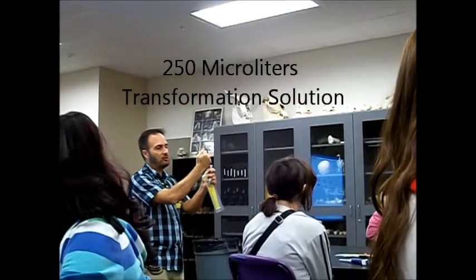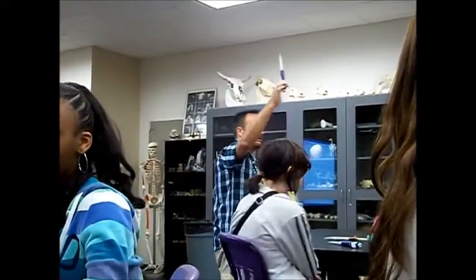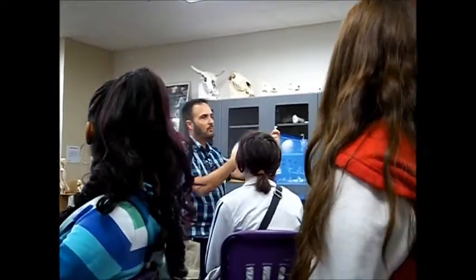And you got to get 250 microliters. You're all experts at using these micropipettes now, right? You got to get 250 microliters into each tube. Basically what this is, it's salt water. It's got a little bit of calcium chloride in water. And what that does is it kind of attaches to the membranes of the bacterial cells and it loosens them up a little bit.